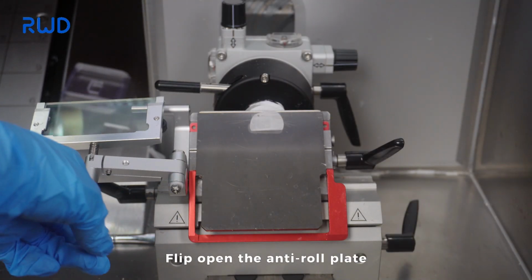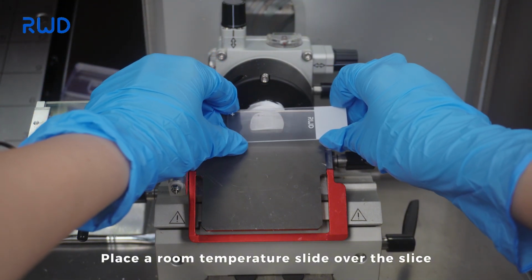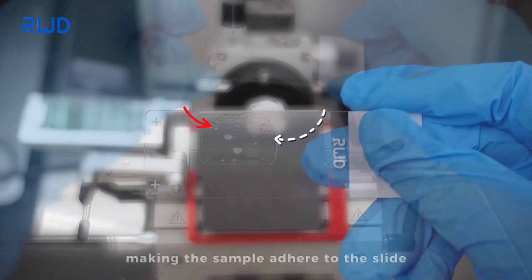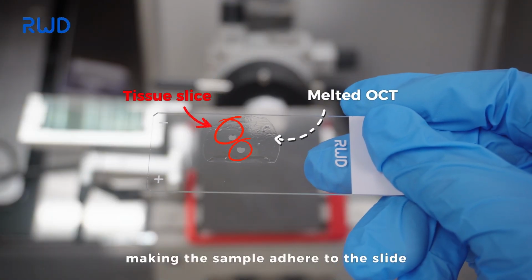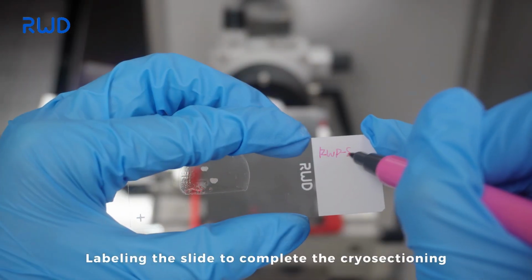Flip open the anti-roll plate. Place a room temperature slide over the slice. OCT melts at elevated temperature when it touches the slide, making the sample adhere to the slide. Labeling the slide to complete the cryosectioning.